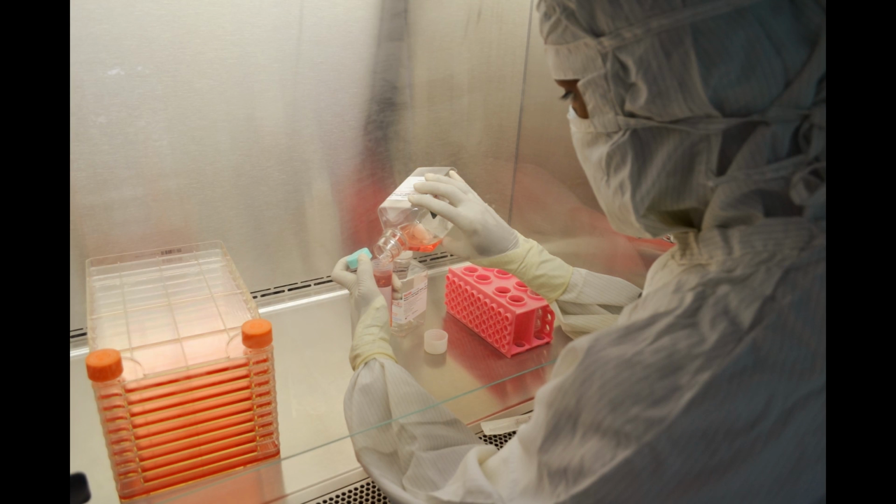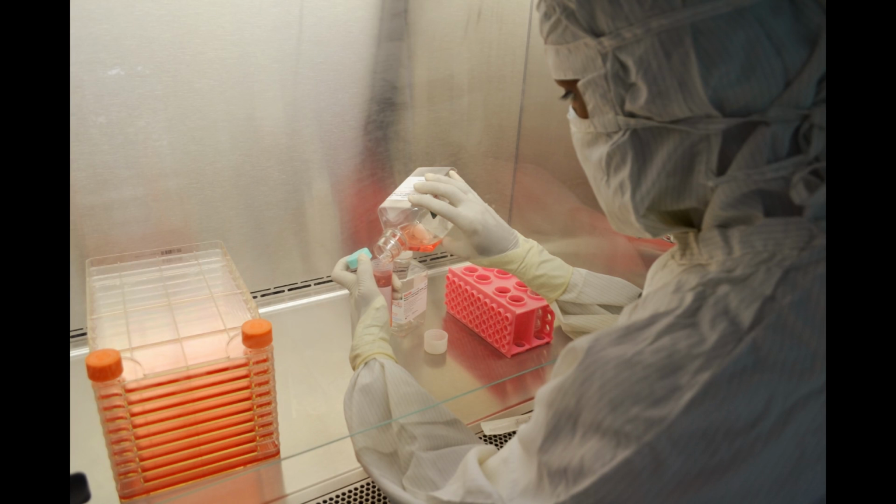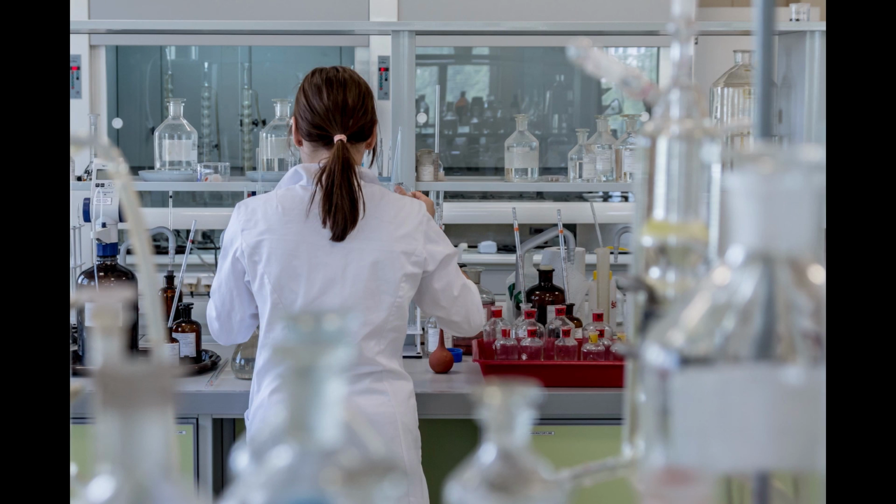This is perhaps why when Hollywood depicts some of the most advanced laboratories working with extremely dangerous diseases, they choose to go to the PC4 facilities. They look impressive, but because of how difficult they are to enter, how difficult it is to use things within them, and often how hard they are to maintain, they're not a common occurrence. In fact, your PC2 and PC3 laboratories are some of the most common levels found for research purposes.